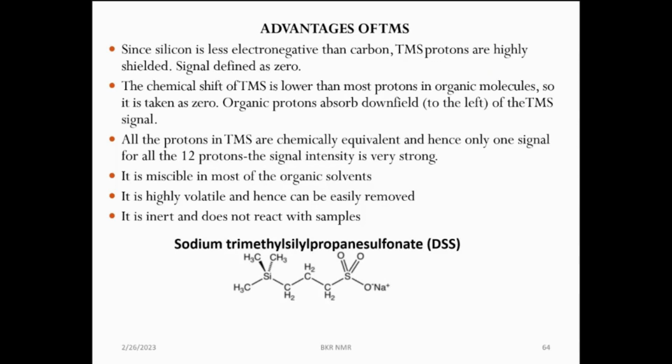Now, we have seen that TMS is miscible in most organic solvents. Suppose I have a compound which is soluble in water. Then I cannot use TMS, because TMS is insoluble in water.